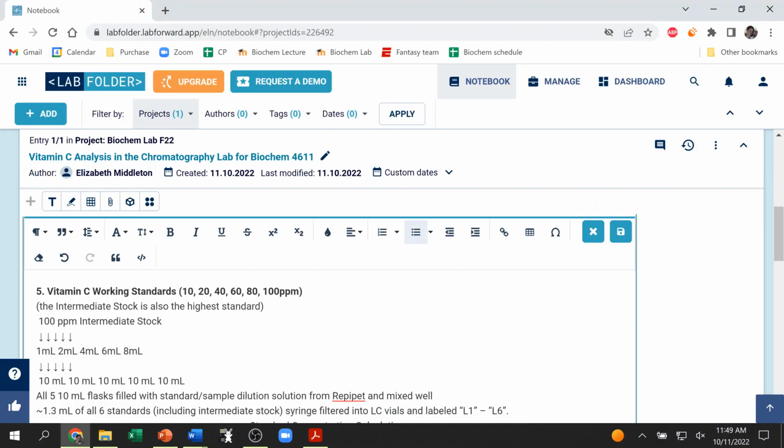So for this, you could either just put the spacing back in, so we could put some tabs in there to spread out the arrows.